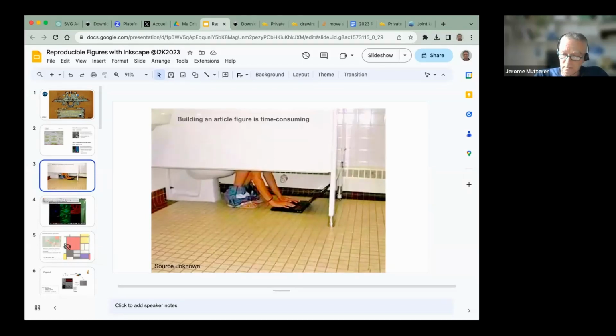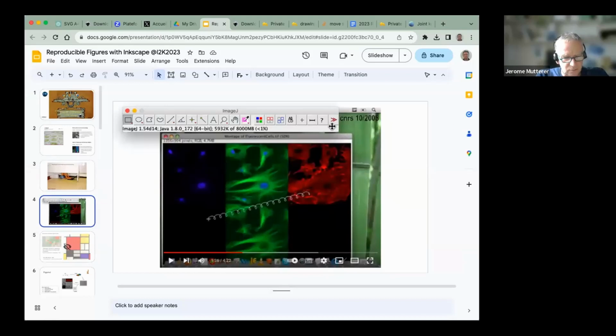And for a very long time, over 10 or 15 years, I've been playing with creating figure content and creating tools to make figure creation easier or more reproducible, using different angles and approaches to facilitate scientific figure creation. One of the first ImageJ macro sets that I did was called Magic Montage. It's now built into ImageJ.